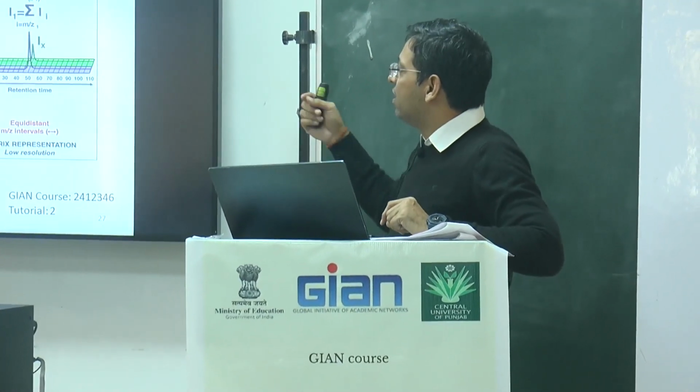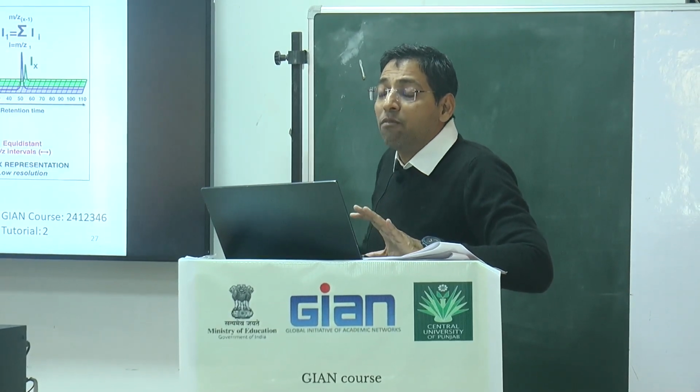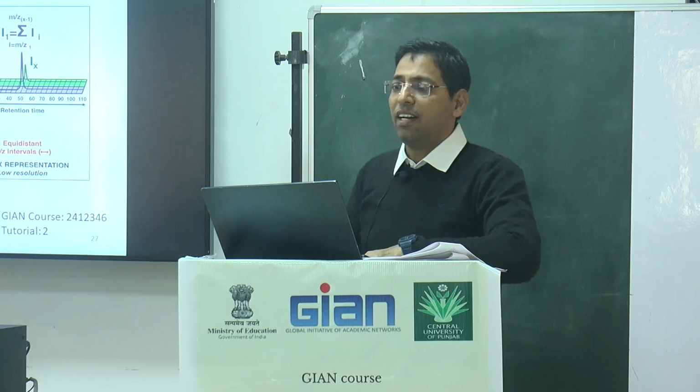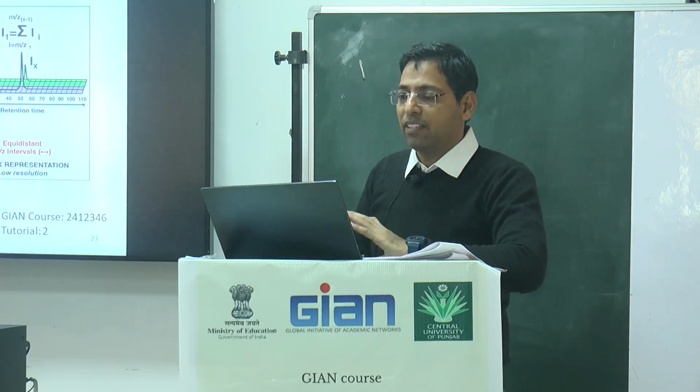So that's why this is associated with data compression. Your information is retained, but you reduce the size of the data here. So this is the first case, and the second case is the region of interest for targeted data compression. That is another point.